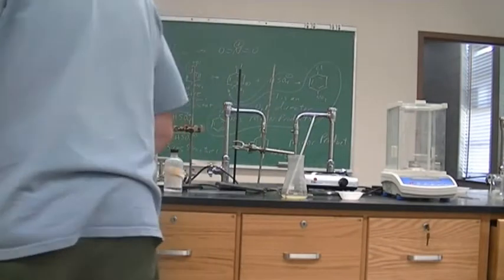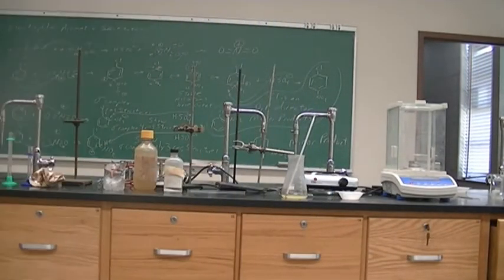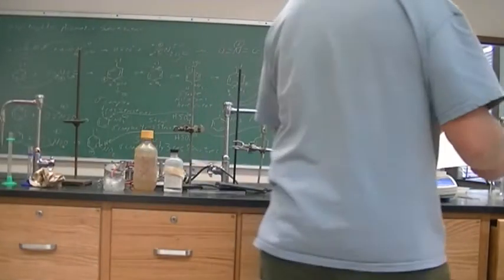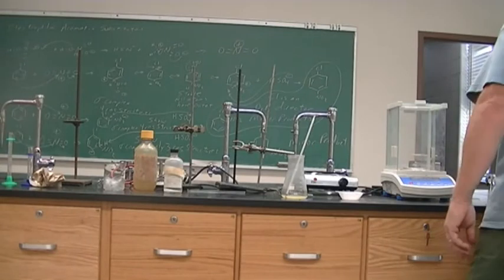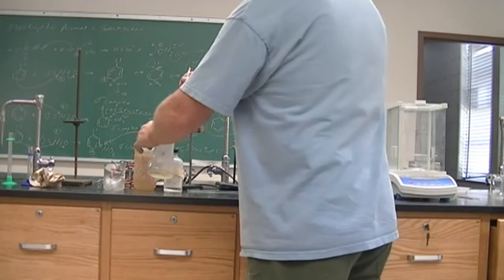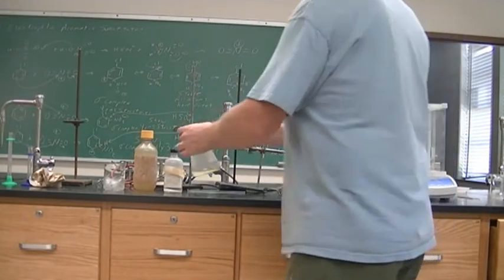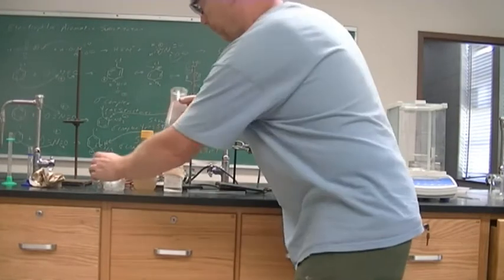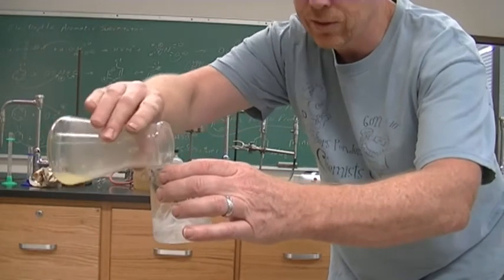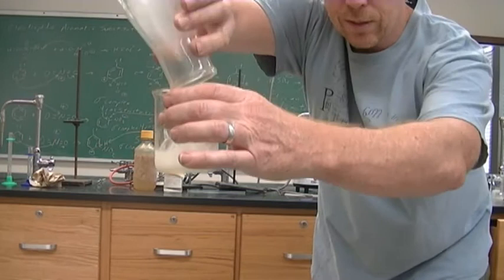All right, so here is our reaction, and I'm going to pour it onto the ice, and then you get a white solid.